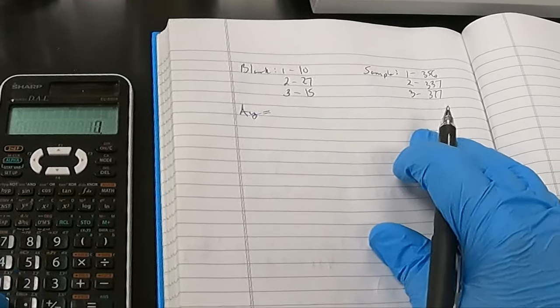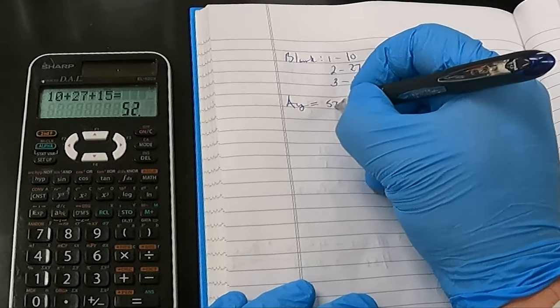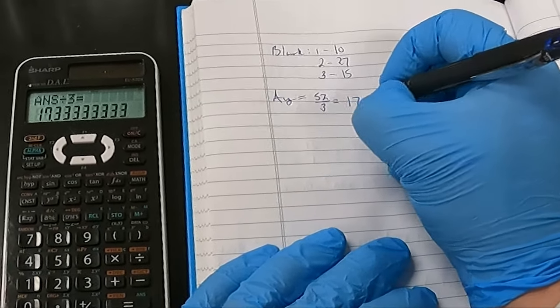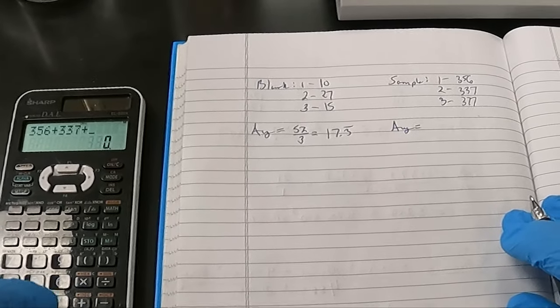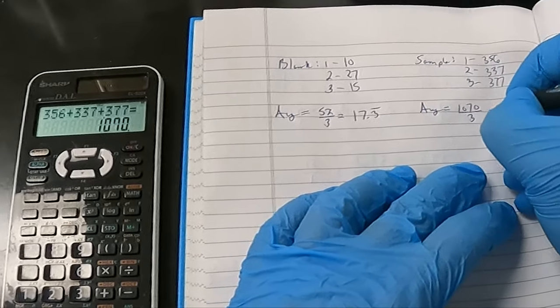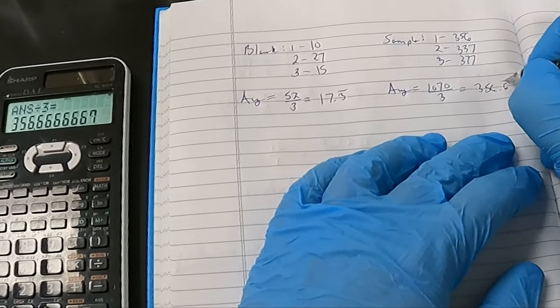Let's see how I did. 10 plus 27 plus 15, 52. Take the average by dividing by 3. 17.3 repeating. Remember, do not round off until the final answer. 356 plus 337 plus 377, 1070 divided by 3 to get the average. 356.6 repeating.